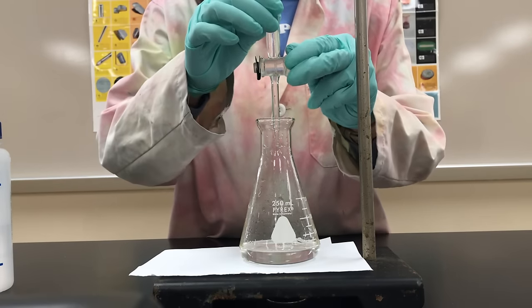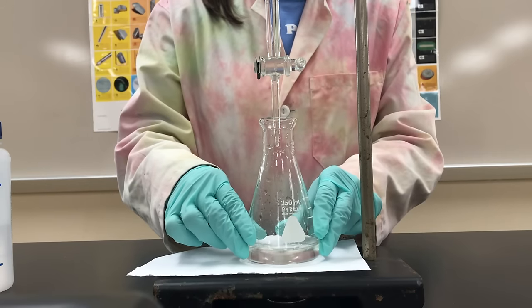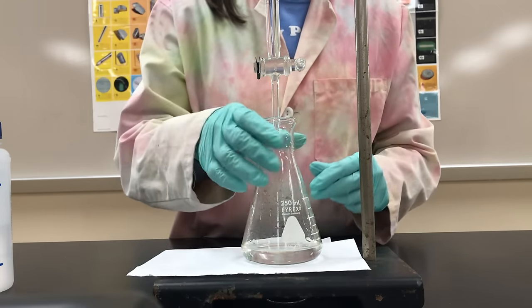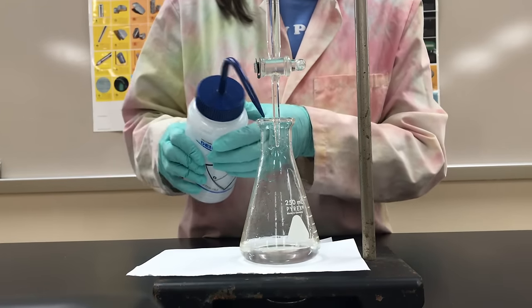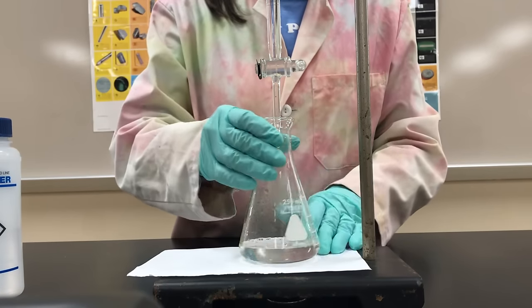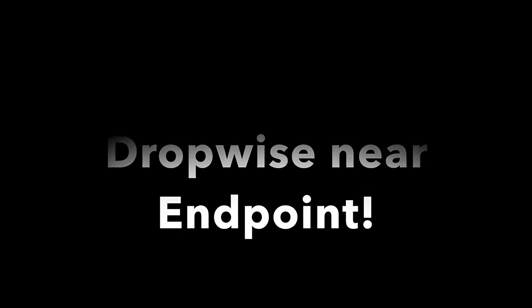As you're running your titration and putting more of your solution that you know the concentration of, the titrant, into the solution that you do not know the concentration of or what the identity is, the analyte, make sure that you rinse down the inside of this Erlenmeyer flask with distilled water. As long as you've measured the volume of your unknown or the mass, you should be able to add distilled water anytime during this titration.